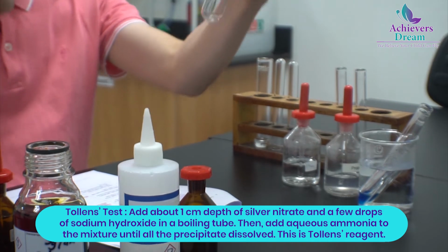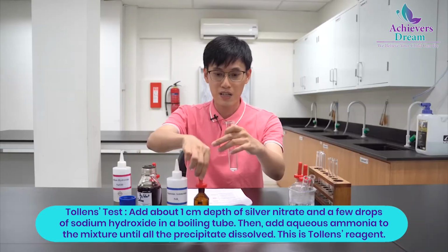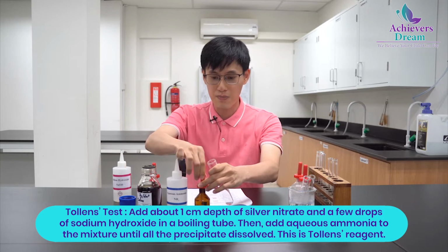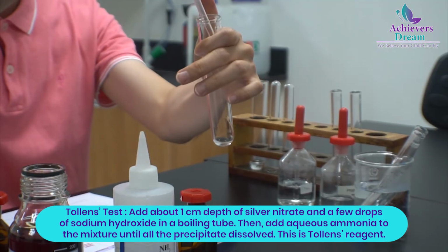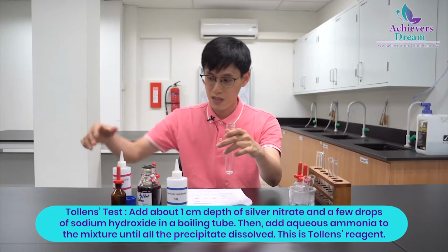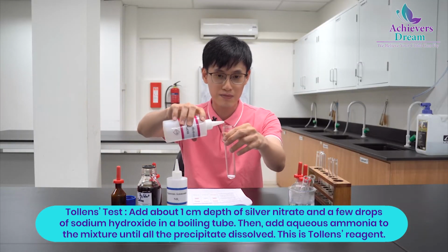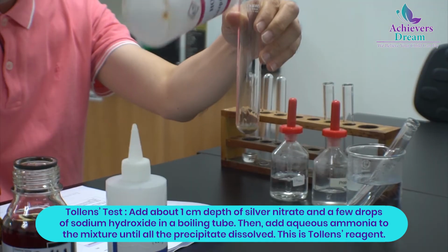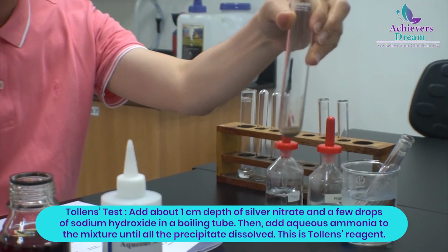Silver nitrate contains Ag+, which will form a silver oxide precipitate when we add sodium hydroxide. That precipitate is brown in color. Just a few drops will do, 2 or 3. You can see the brown precipitate forming.